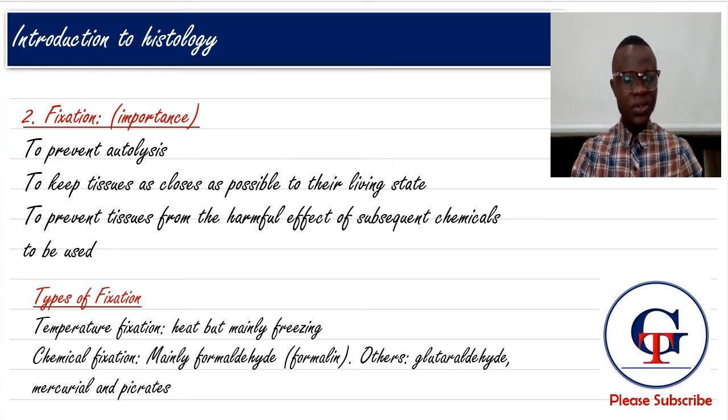Also, we do this to keep our tissue, as I stated, as close as possible to its living state. And lastly, we do this to prevent our tissue from the harmful effect of subsequent chemicals that will be used in this entire process of preparing our tissue. So those are the major reasons we carry out this process.